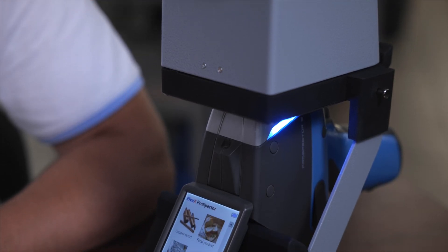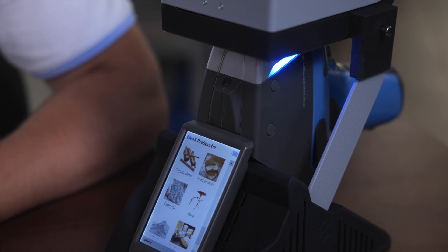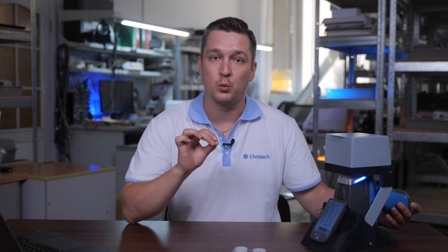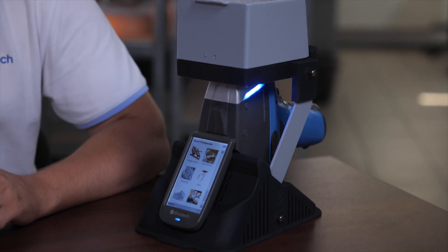Now let's sum up and look at the main benefits of using Prospector 3 and the lab stand for cement analysis. Prospector 3 is a compact and portable solution, perfect for both lab settings and field work. Its high accuracy and fast analysis speed allow you to make quick decisions about cement quality on the spot. The lab stand assembles in just 30 seconds, making it an essential tool for mobile labs and field conditions. The stability provided by the lab stand ensures accurate results even in challenging conditions – this is crucial when high precision is required for cement quality control.